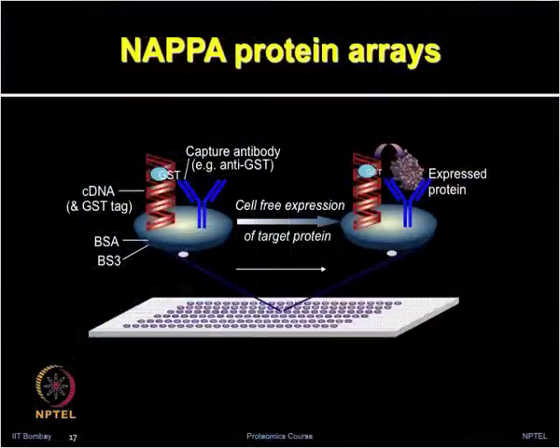In NAPPA arrays, the master mix contains DNA and other components which can be stored at room temperature. So, the storage form of NAPPA microarray contains only DNA. Therefore, shelf life or storage of these arrays is not a major concern. I think this is one of the major advantages and major milestones achieved from using the NAPPA method.